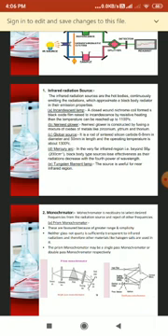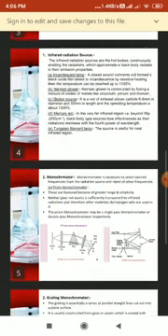And the last radiation source is the tungsten filament lamp, which is useful for the near infrared region only. Now we have seen the second instrumental part, the monochromator.